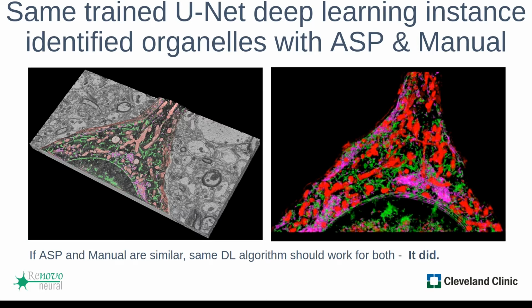So here, the Golgi apparatus membranes are in magenta. The mitochondrial network is shown in red, and the smooth endoplasmic reticulum network is shown in green. Except for just ignore the nucleus part. We talked about that. All right, so I'm just moving on to the next slide.